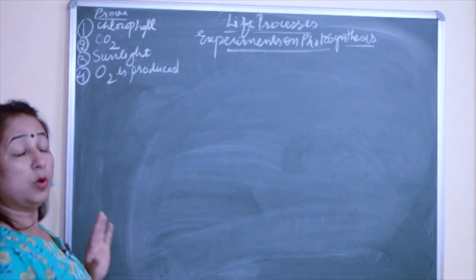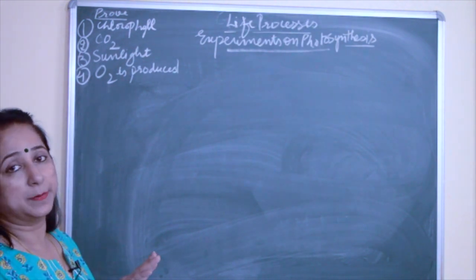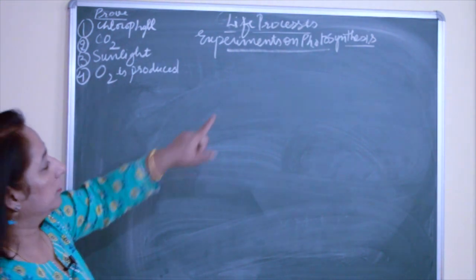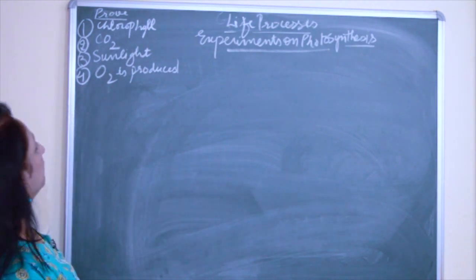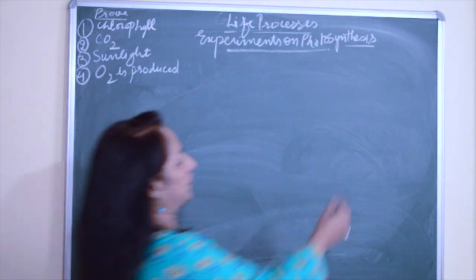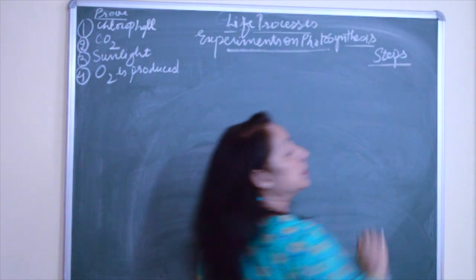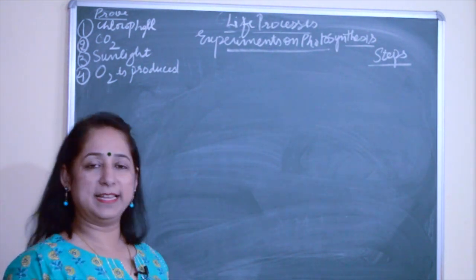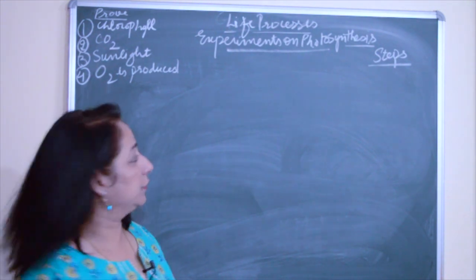during photosynthesis. Fine. So these are certain experiments which we have in our book for the process of photosynthesis. Let's do them one by one. Before we start with any of these experiments, there are 2 steps in all these experiments which are common. Whether we are doing first, last experiment, any experiment, these steps remain common for any of these.